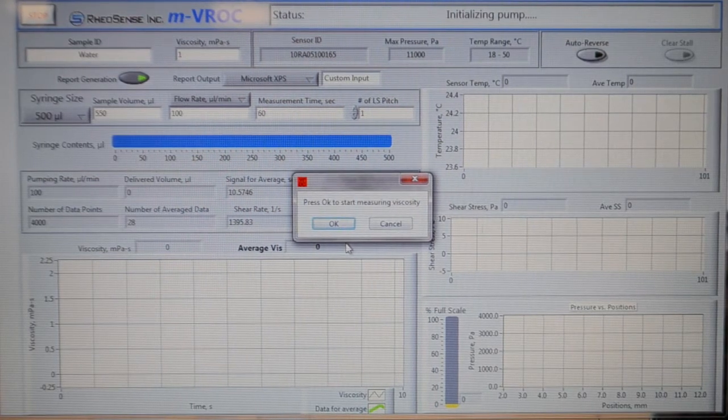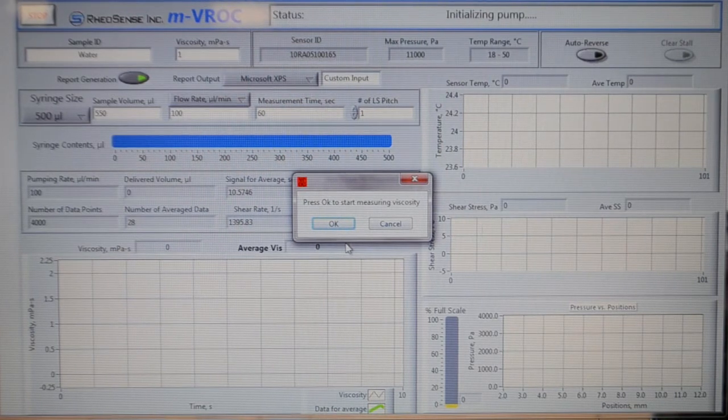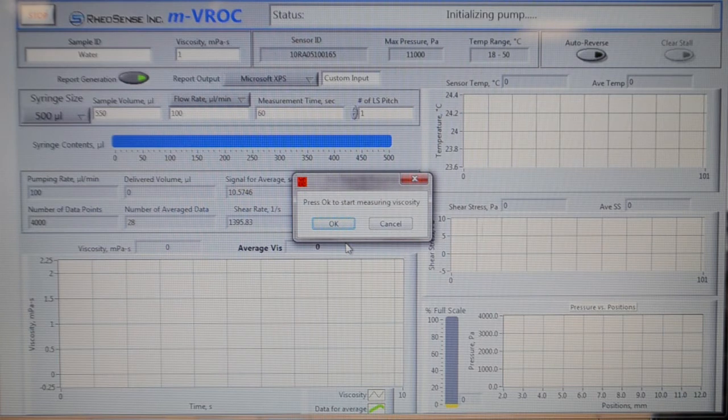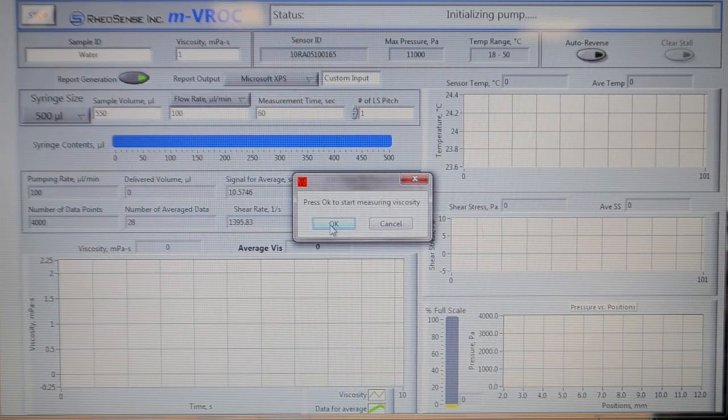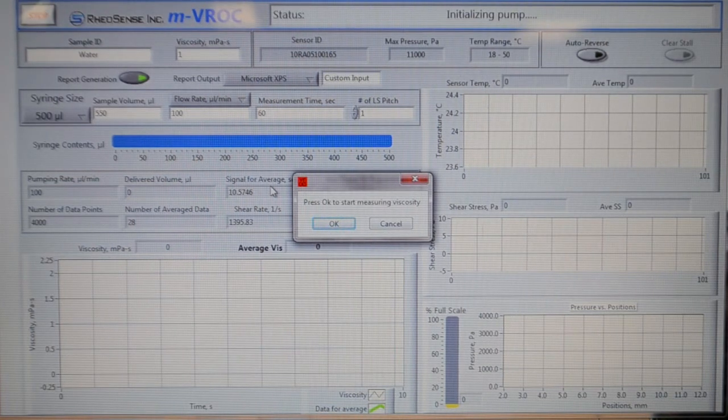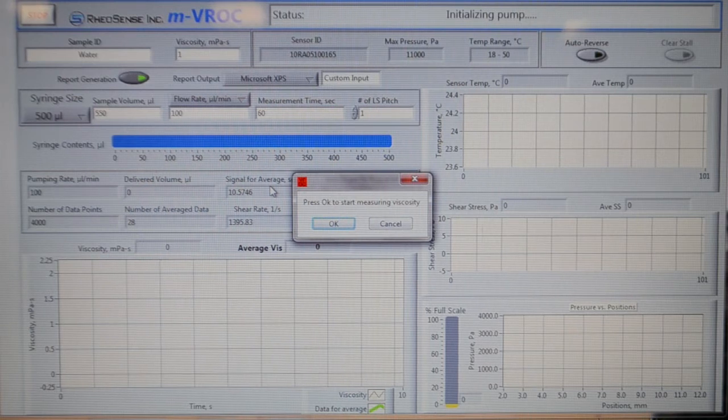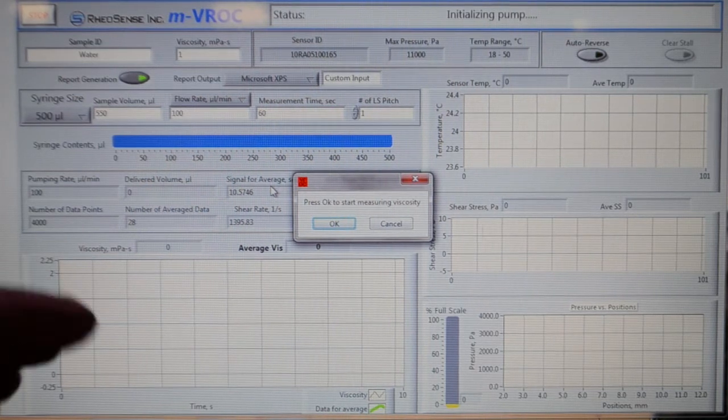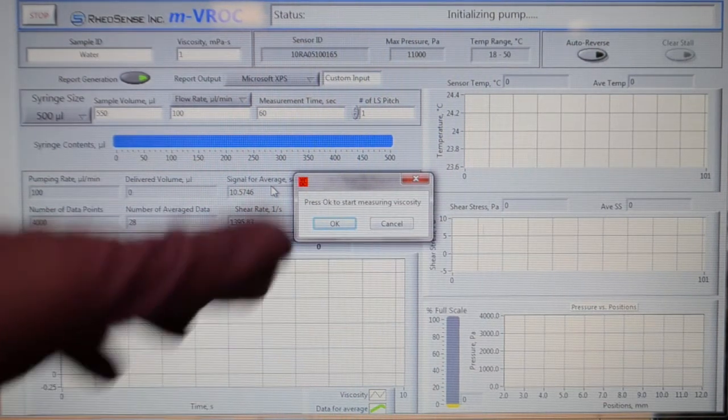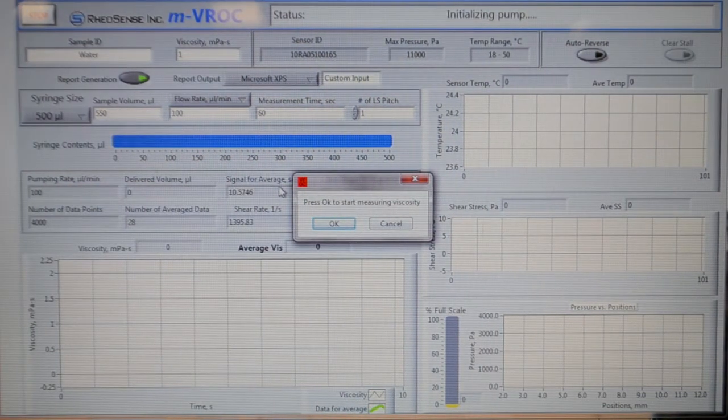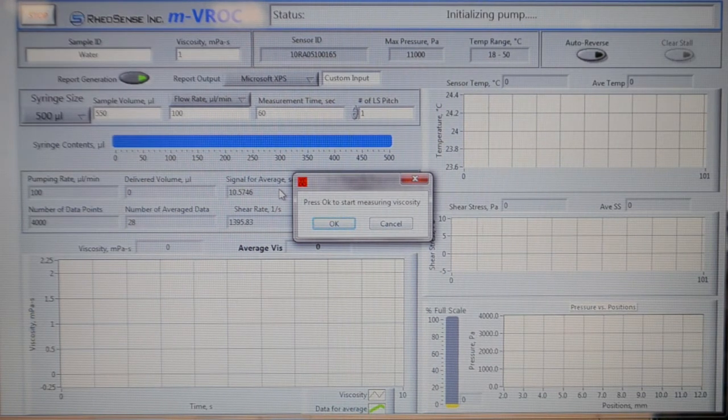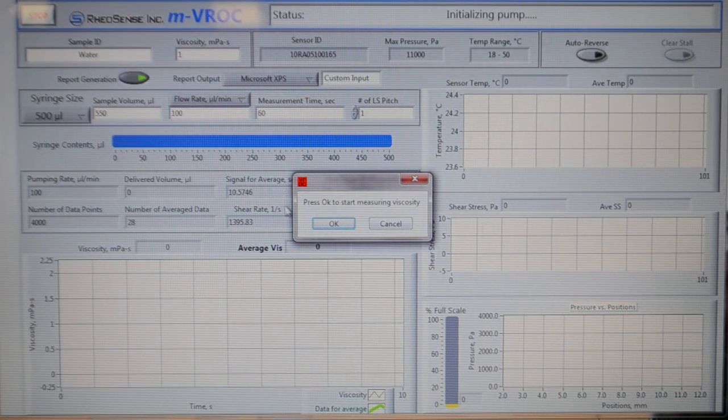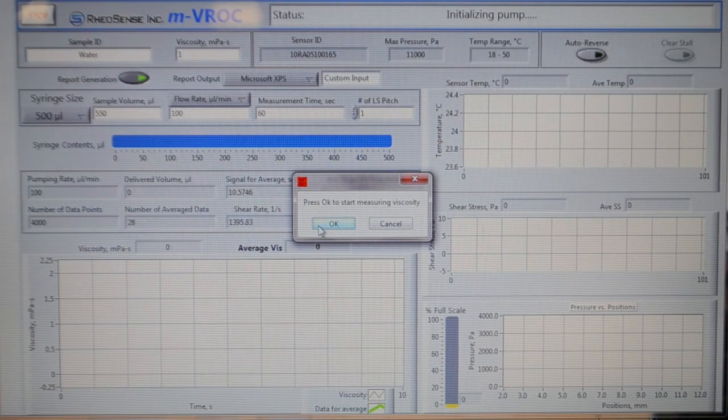Now press OK to start measuring your viscosity. But before you do that, you want to make sure that once you press OK, you move your cursor back to the stop button, so you can stop the run immediately as soon as you see the viscosity rise. Because that would indicate an actual physical contact between your push-a-block and your syringe piston. So let's go ahead and press OK.